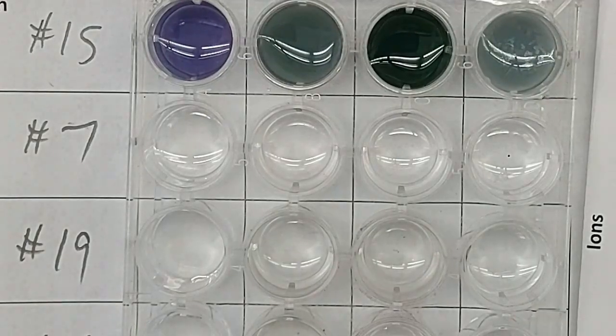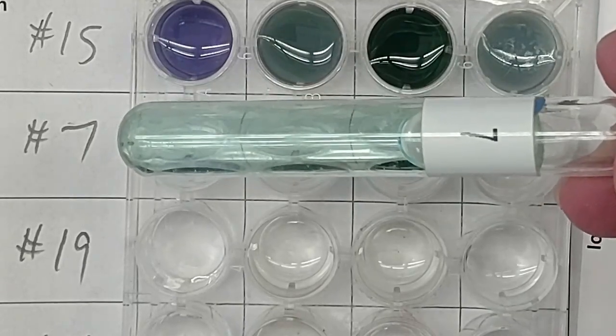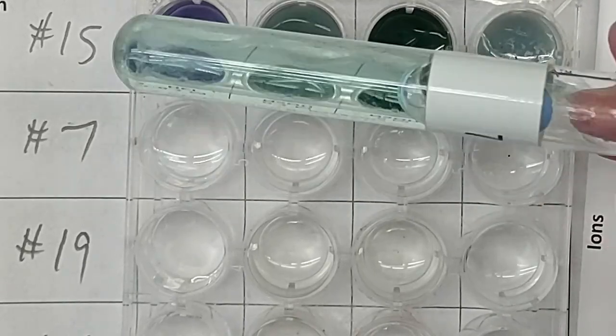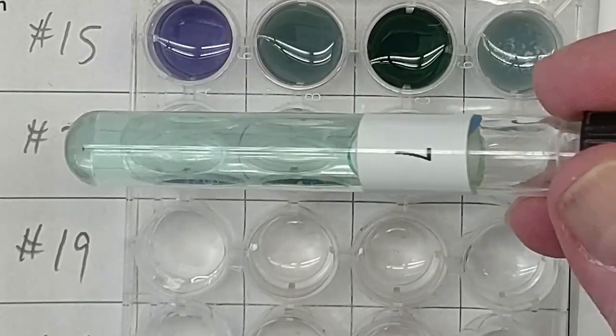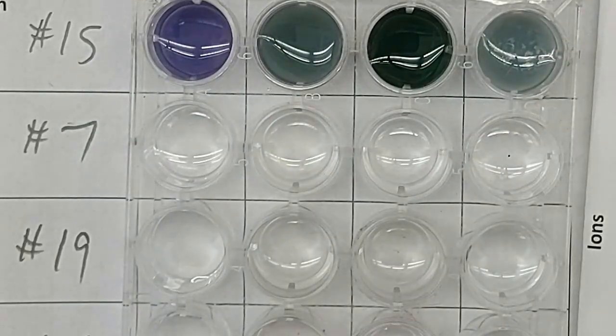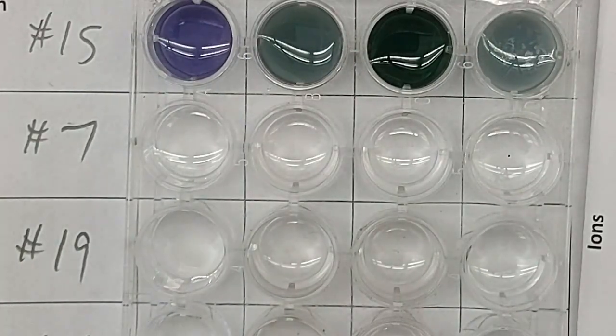Let's go to number 7. There's number 7. Can you tell what it is before we even start? Write down your observation for what it looks like before we even add anything. And then let's add it to each.